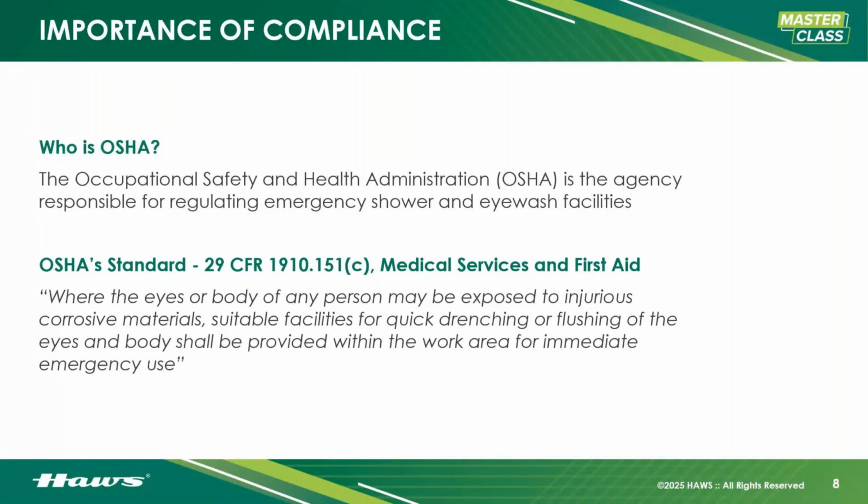They're very important. Now, their standard, 29 CFR 1910.151(c), for general industry, but they're also under the construction standard, you have 1926.50. So this is communicated in a couple different ways in the standards, but the primary one that we'll be referencing is 1910.151(c), but just know that there is a construction reference in this as well.